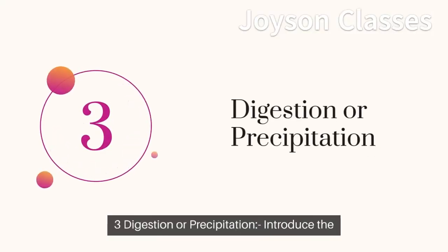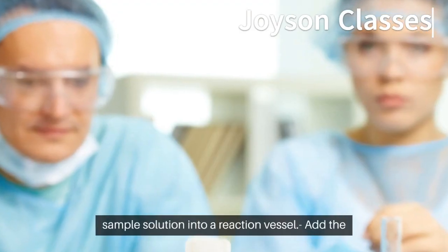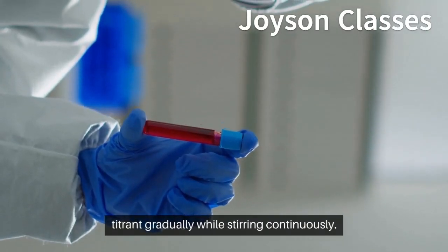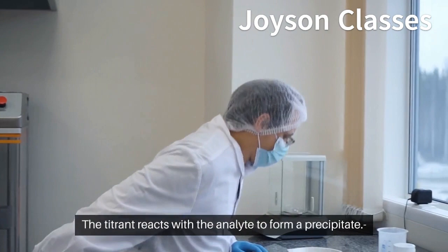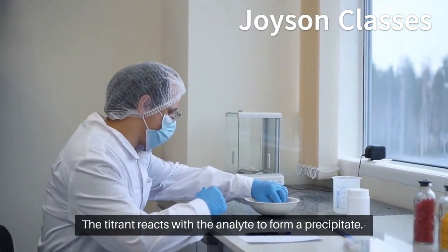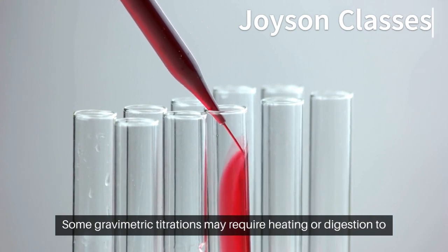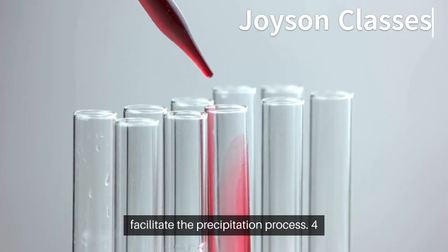3. Digestion or precipitation. Introduce the sample solution into a reaction vessel. Add the titrant gradually while stirring continuously. The titrant reacts with the analyte to form a precipitate. Some gravimetric titrations may require heating or digestion to facilitate the precipitation process.